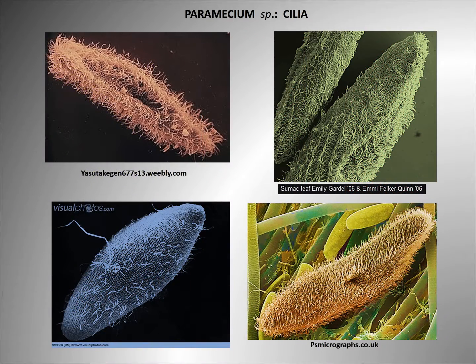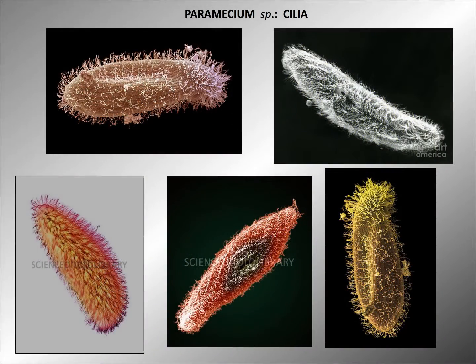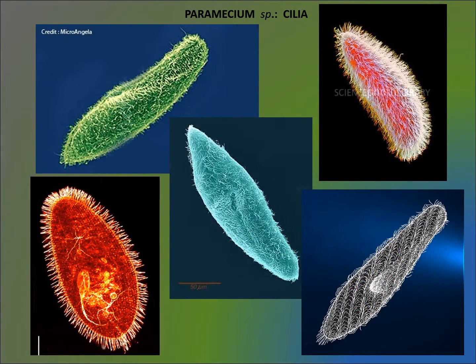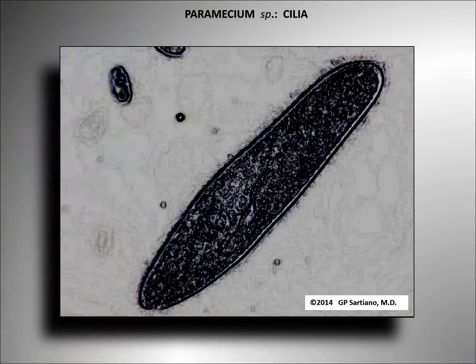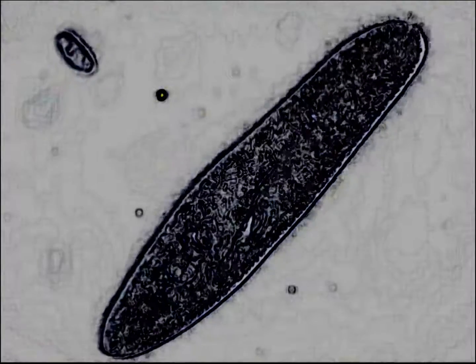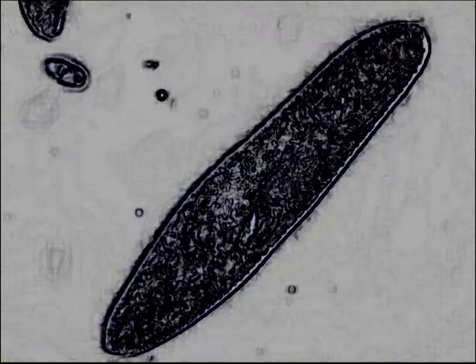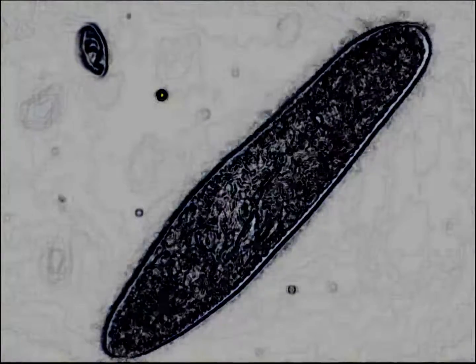The number, density, and arrangement of the cilia of Paramecium have been verified and documented by SEM on many occasions. These observations are illustrated videographically using edge detection technology.